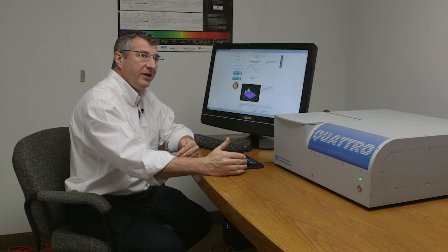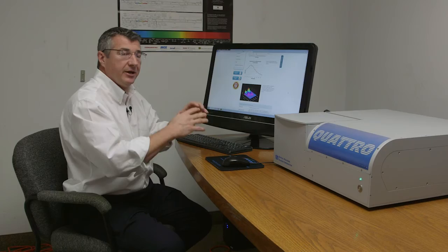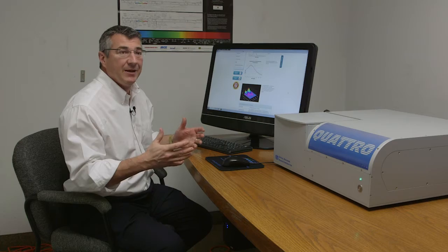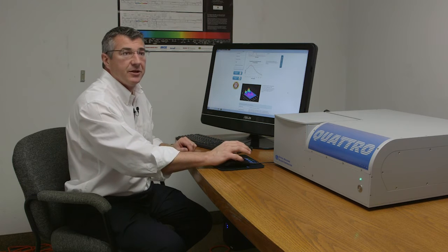We're also showing on our website here a data set that was collected where we're actually measuring phosphorescence decay as a function of wavelength and with the sensitivity of the instrument and the speed of the hardware and the detection electronics we're able to actually capture an entire three-dimensional matrix in only a few seconds. It really can't be done with any other technology that's out there now.